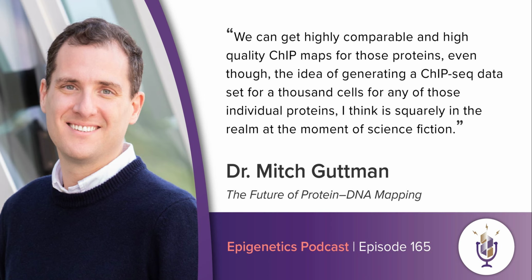What I will say is I would have to actually go back to the methods of the paper to remember how much we used. I think when we first started, we did start by using a similar amount of antibody as we would for a traditional ChIP experiment for each component, but that is certainly overkill. And what we know is a couple of things. The first is that a lot of it depends on the abundance of the protein target.